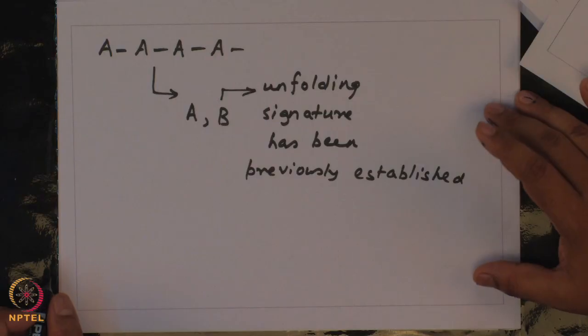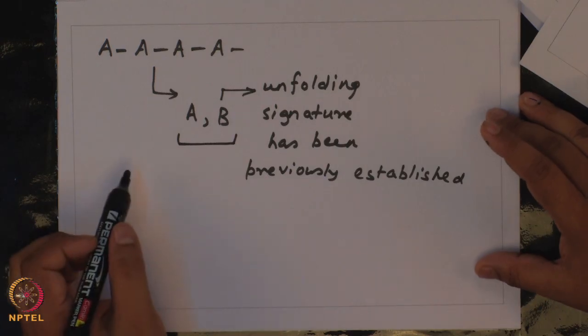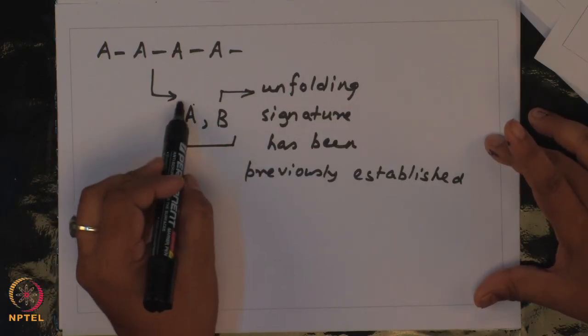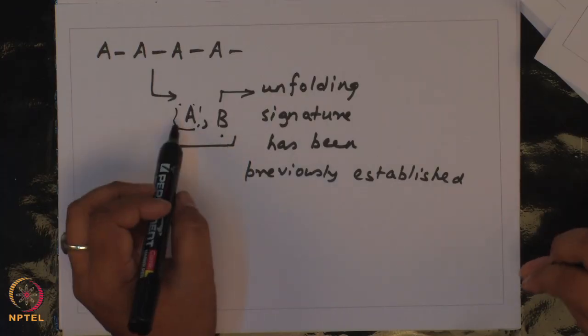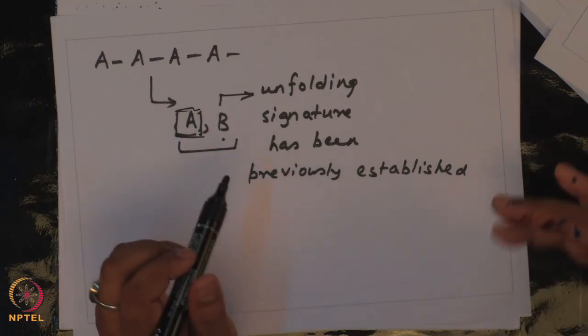The rationale is that because B has an unfolding signature, even if you do not get A, your B signal should always appear in the protein unfolding signature. In that case you can say that probably A has very low unfolding forces, which is why we cannot detect it.